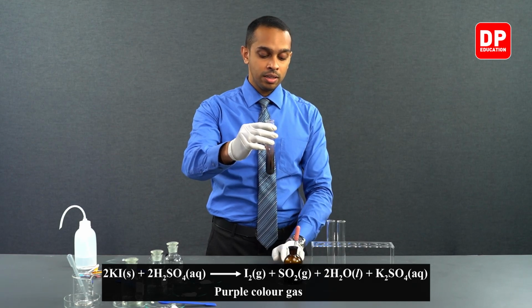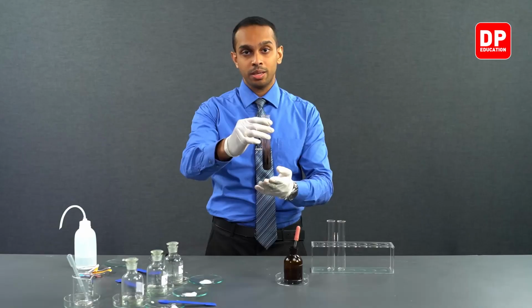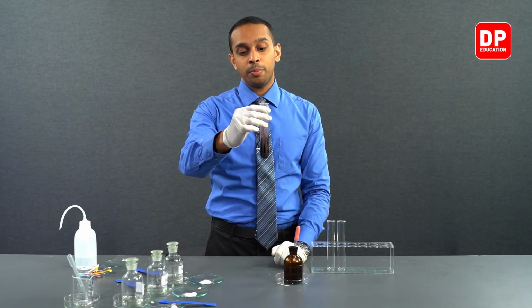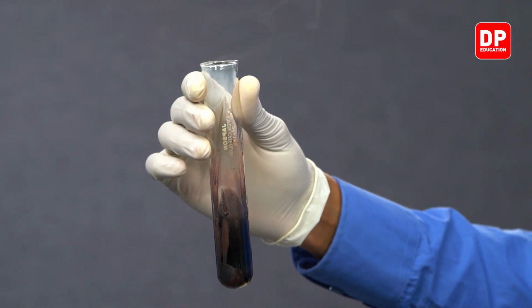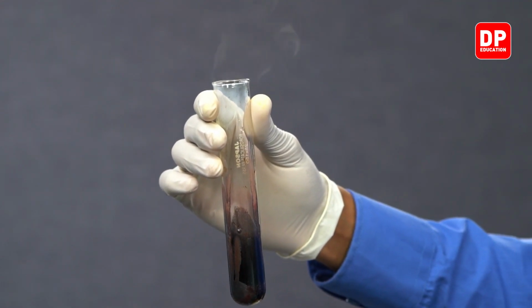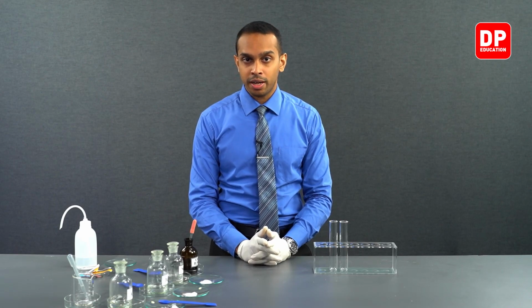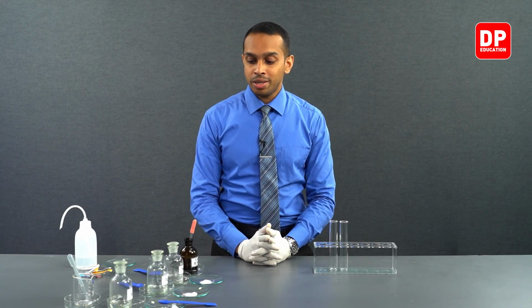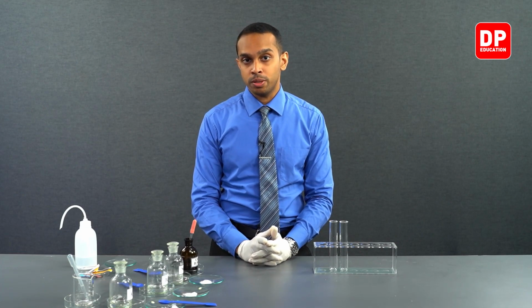When you react a good oxidizing agent like concentrated sulfuric acid with potassium iodide, the iodide ions in the potassium iodide will be converted into I2 and form I2 gas, which is evolving here as a purple color gas. In the previous experiment, we added concentrated sulfuric acid to potassium iodide solid, and we saw a purple color gas, iodine gas, I2 gas, being formed.